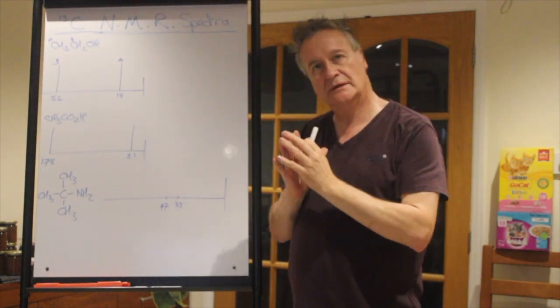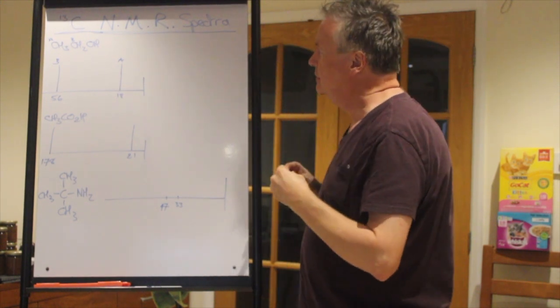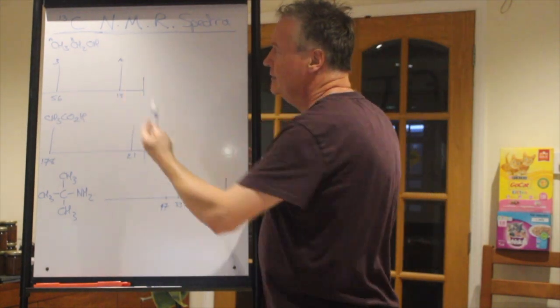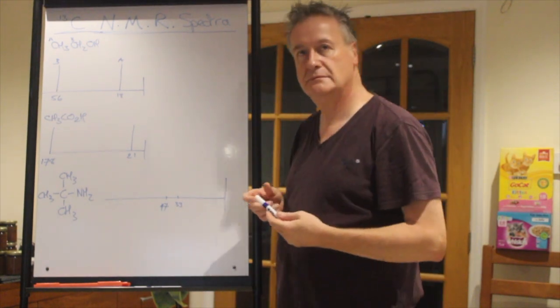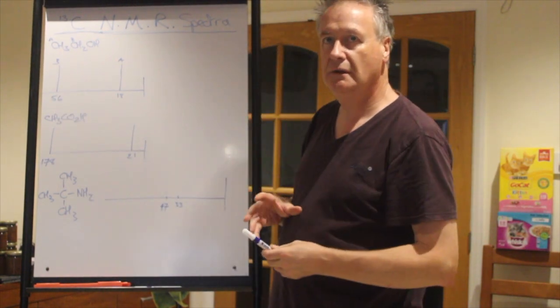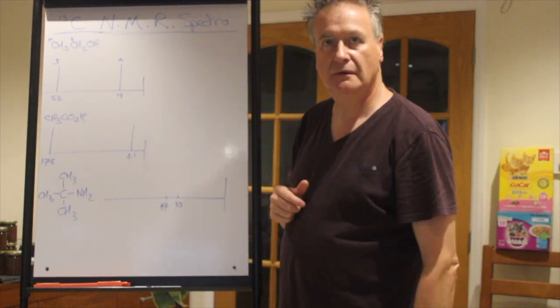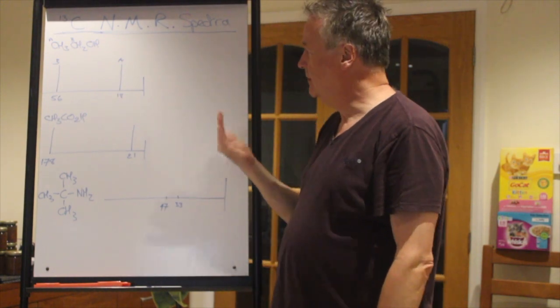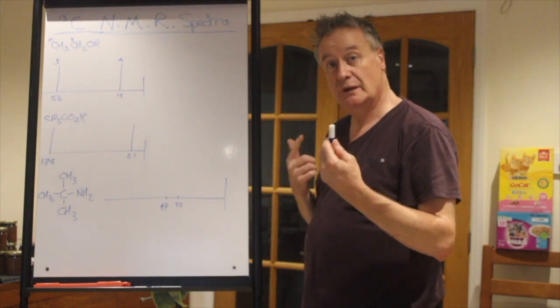Well, you get out the data booklet, and when you look at the carbon-13 NMR information, it says that the one that's attached to an O, which will go on to be the OH group of the alcohol, will be in a region that includes the number 56. And A is just an alkyl version, which is in a much lower ppm number, slightly higher energy. Same height because there's 1 carbon in each.